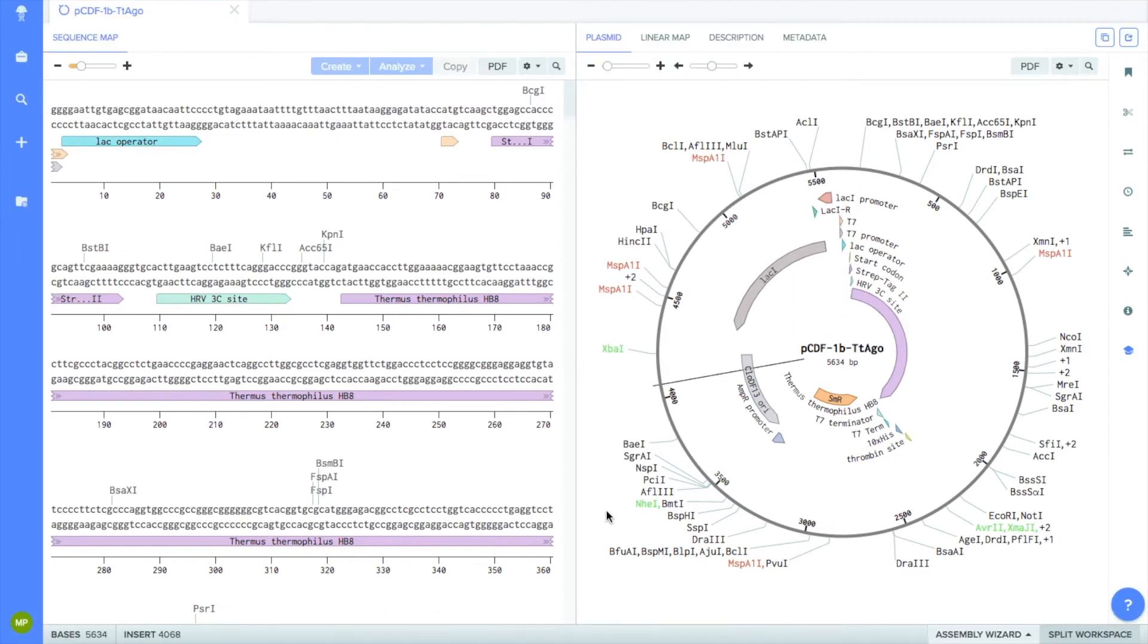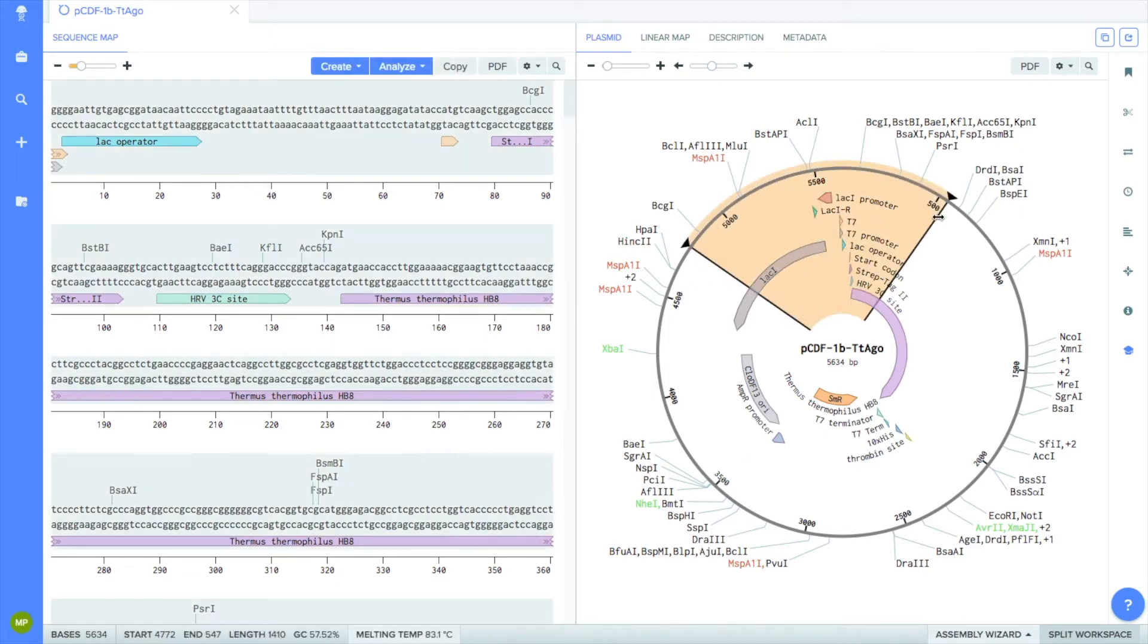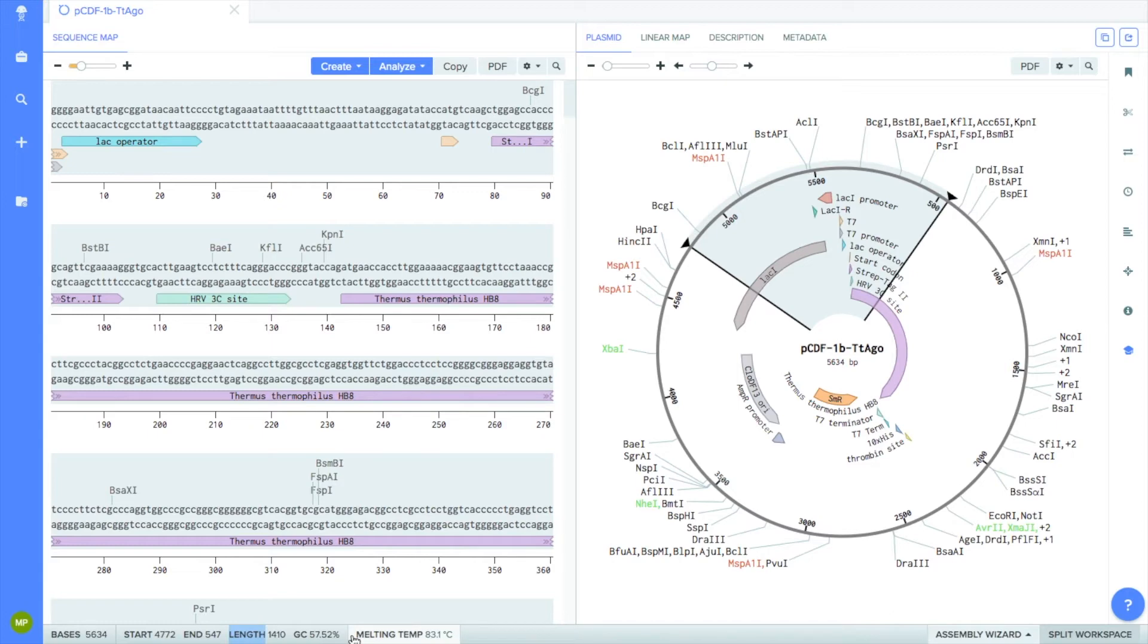So at the bottom left, there are two values. One is labeled Bases, and the other is labeled Insert. The Bases value tells you the total number of base pairs, or nucleotides, in your uploaded DNA sequence. The Insert value tells you the base pair position of your cursor on the DNA sequence. If you click and move your cursor around the plasmid, it shows you the start and end base pairs of the highlighted sequence, or portion, along with its length and melting temperature.